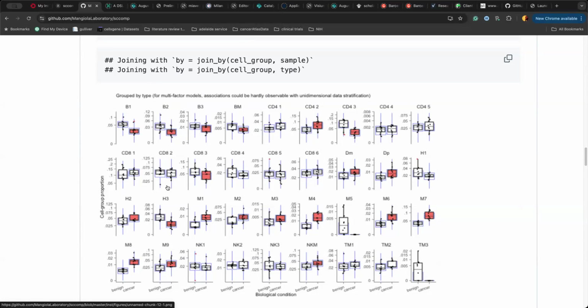Also, this blue box plot is the data generated from the model. This is quite important, because if the blue box plot overlaps with your data, it means the model is descriptive of your data. It's a bit like this: you can fit a normal distribution on a gamma, but if you ask the model to reproduce the data, those two distributions will have very different shapes.